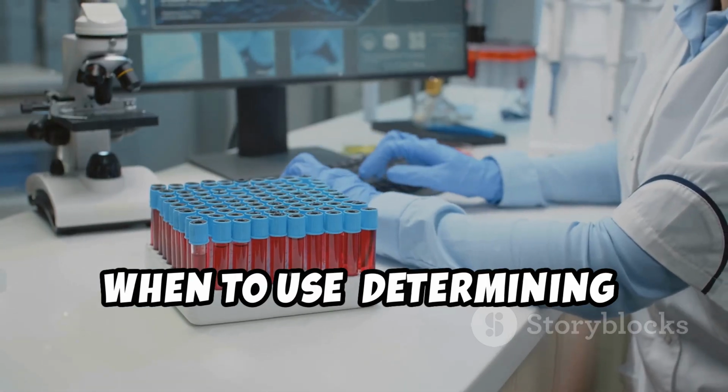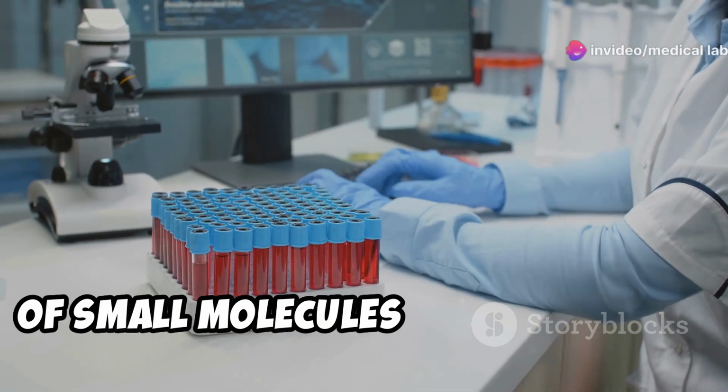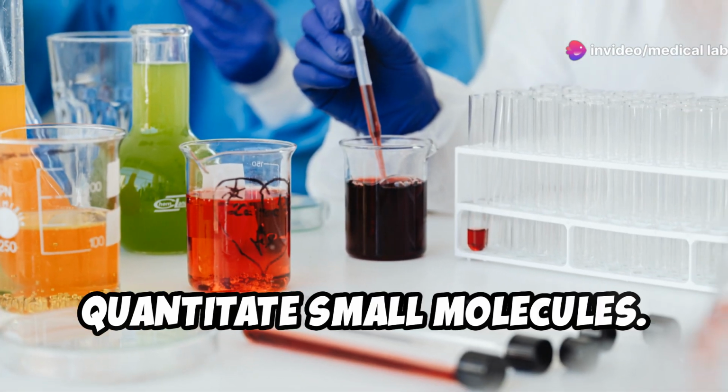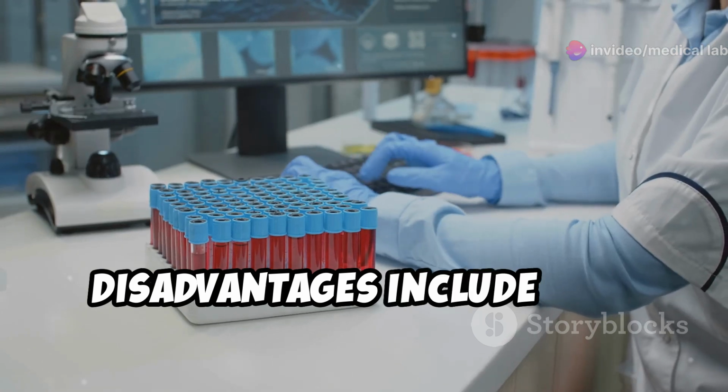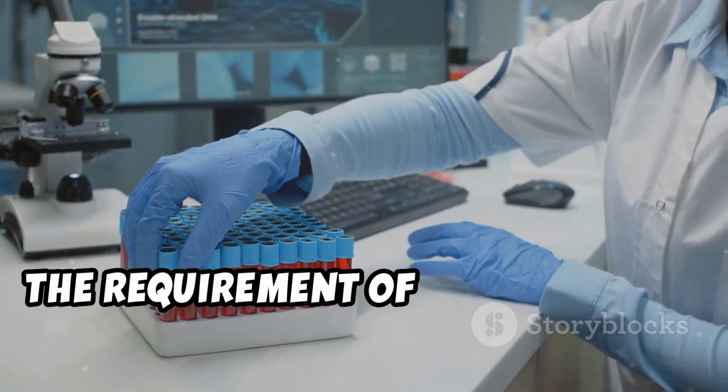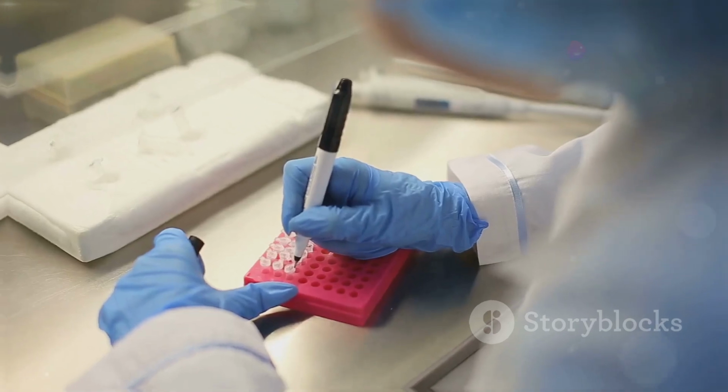When to use: determining concentrations of small molecules and hormones. Advantages include the ability to quantitate small molecules. Disadvantages include less specificity since you are only using one antibody, and the requirement of a conjugated antigen.